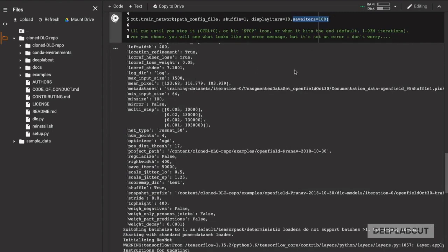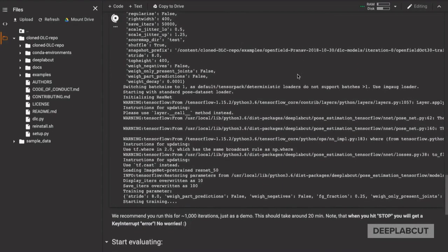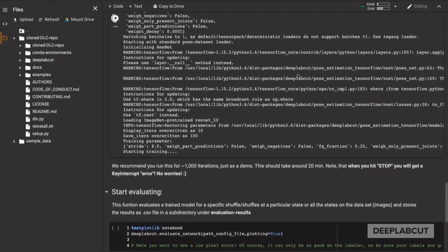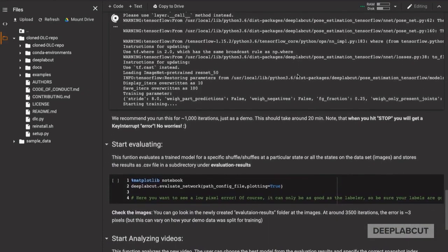For this short demo, we're going to set save iterations to a very low number and only run for a few hundred iterations. In general, though, you're going to want to save at maybe every 10,000 or 15,000 checkpoints, and then run this to about 200,000 iterations on your own data.